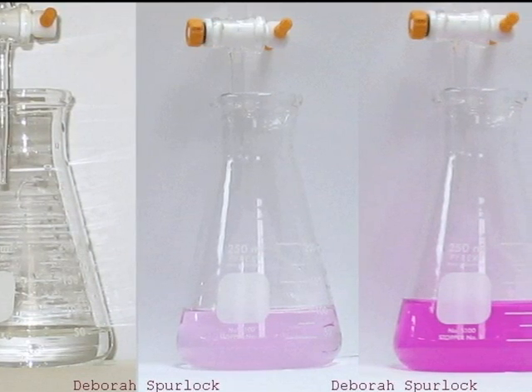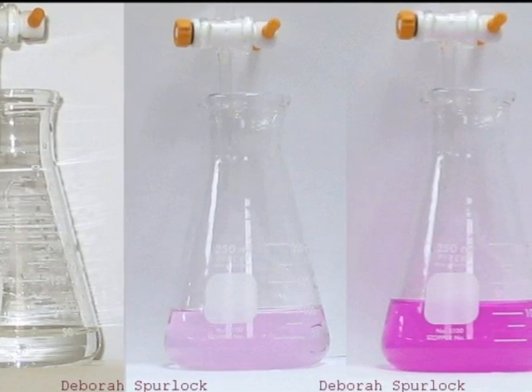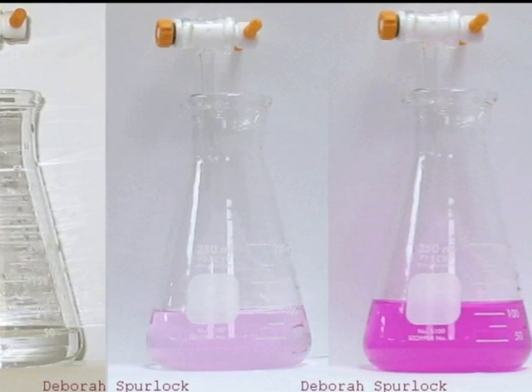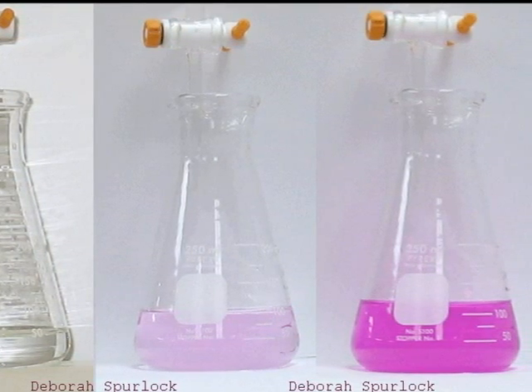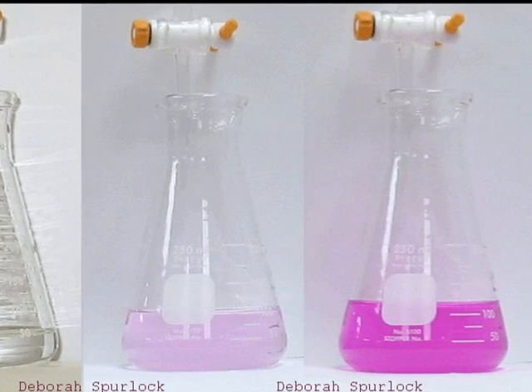The phenolphthalein changes from colorless in acid to pink in base. The examples show an acidic solution on the left, a basic solution on the right, and a solution at the end point in the center.